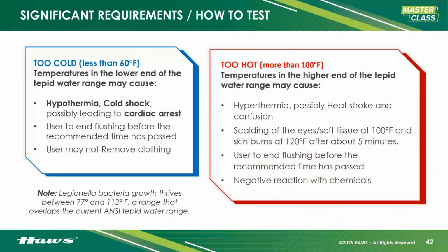Now, too cold, and what we're risking if it is too cold is hypothermia, cold shock, possible cardiac arrest, right? The outer insulation of our body is potentially already compromised, right? If we have been exposed to corrosive materials, we will bleed heat very quickly if that is not in place and intact. Okay, and if we're dumping 60 degree and less water, hypothermia can come on very quickly depending on your build. Okay.